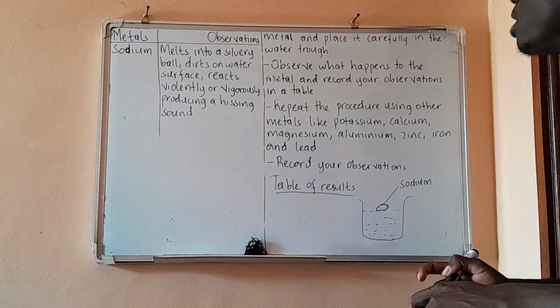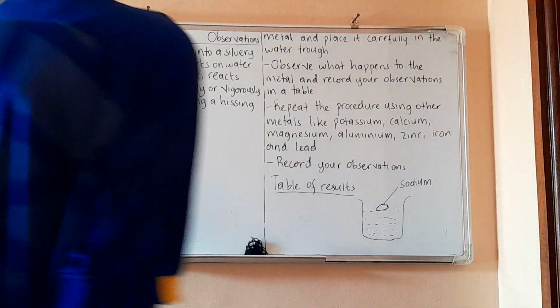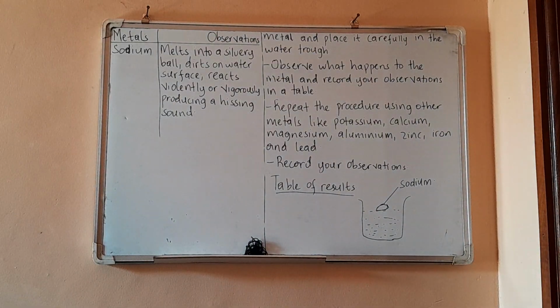It melts into a silvery ball on the water surface, reacts violently or vigorously, producing a hissing sound.